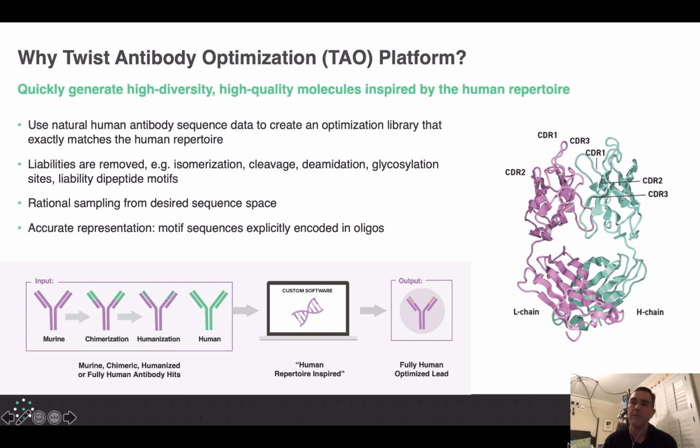So for example, oftentimes I'll use a mutational distance of 3. So it'll basically give me back all CDR sequences within that germline family that are within 3 amino acids of my parent reference antibody CDR sequence. And then I can use those sequences to then construct a library in phage display and do all of the downstream selection and screen to find optimized variants of my reference antibody.